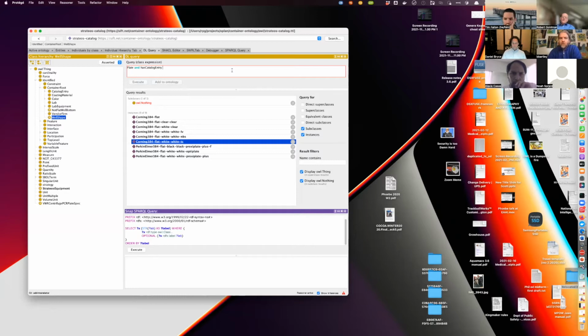I got a question. In your example before, you put something like a clear plate. Do we have standards for the attributes that would be across all the different entries, so that we could query those attributes and make sure that we get a bunch of brands that are equivalent? Actually, I'm not sure I fully understand that question.